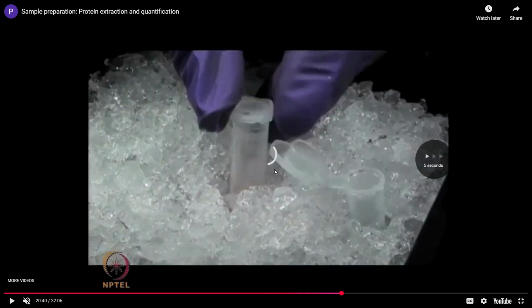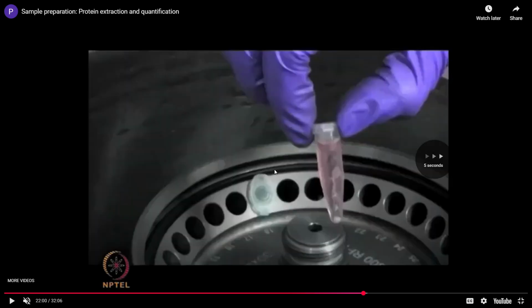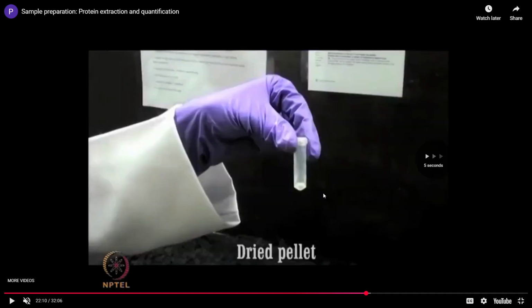And after that, you need to add ethanol. After you add ethanol, the DNA will get precipitated. This is how the DNA gets precipitated. Then you'll take the upper layer itself, which will have protein.